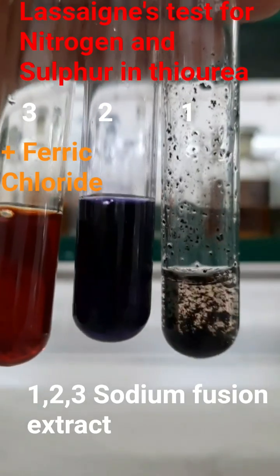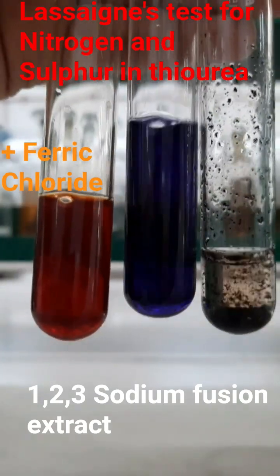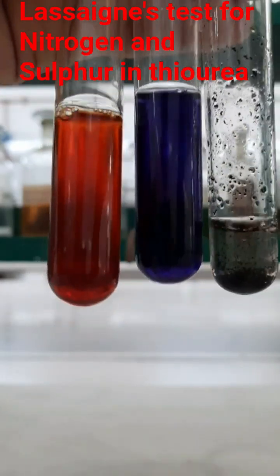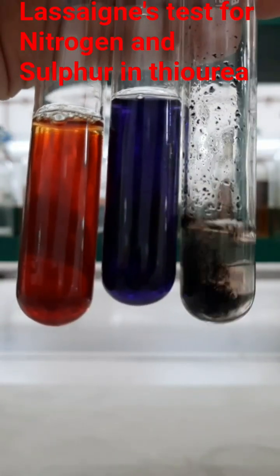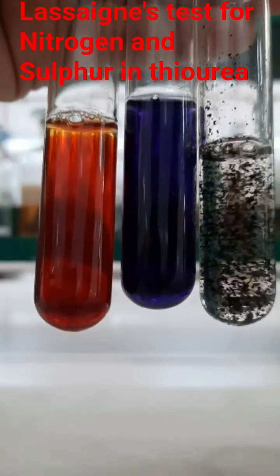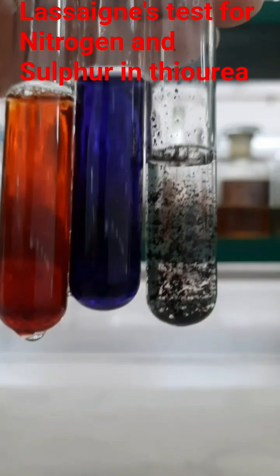After adding ferric chloride solution, the appearance of blood red color is due to the formation of ferric thiocyanate complex. Now I am adding some distilled water so that the colors may be observed properly. After adding distilled water, in the first test tube you can see the black precipitate of lead sulfide, and in the second test tube the violet color.